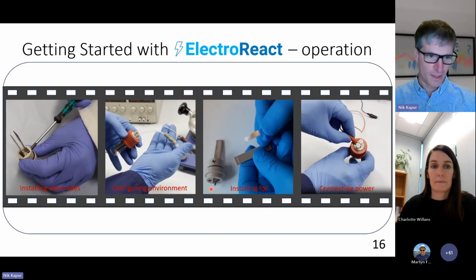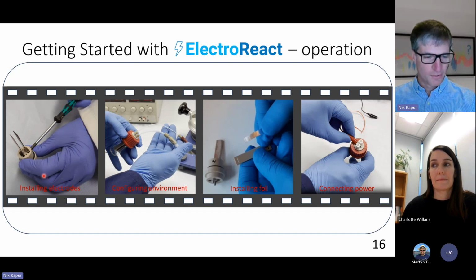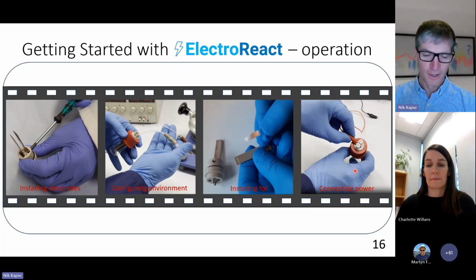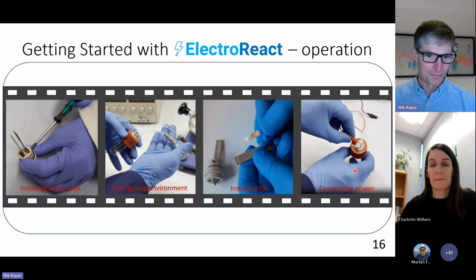So I'm not going to run the videos. You'll have time afterwards to go and investigate that. But there are videos on installing electrodes, configuring the gas environment around your bottle reactor or your ElectroReact platform, how you go about folding and inserting the foil, and that's, again, just a 2 or 3 minute job. After you've done it once, it just becomes second nature, and how you go about connecting power. So all really straightforward operations.